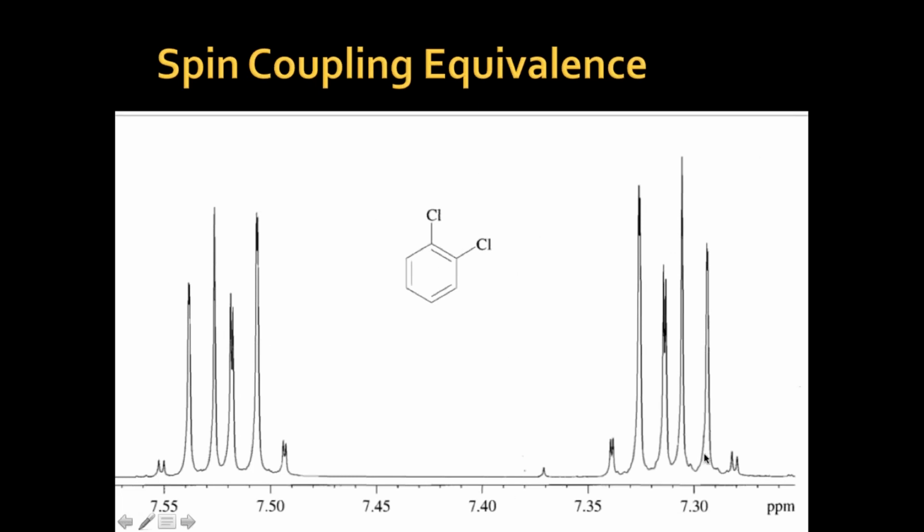Another example, let's see 1,2 orthodichlorobenzene. This example is also important because this molecule has a plane of symmetry.